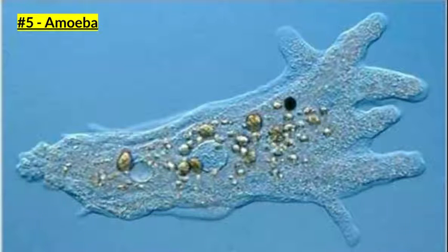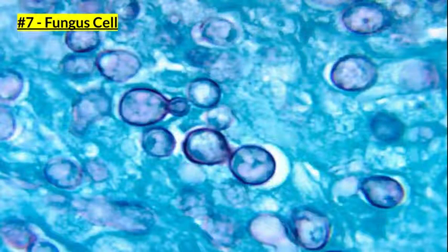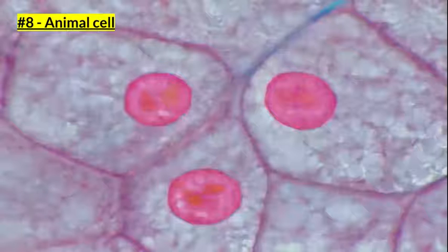amoeba. So on the amoeba, I do want to point out that it does not have a rigid structure. It has a lot of things coming out of it. Those are also actually called pseudopodia, which means false feet. It's very movable, and so that definitely tells me there's no cell wall, which means it has to be an animal cell. Algae. This is just a typical fungus cell again.